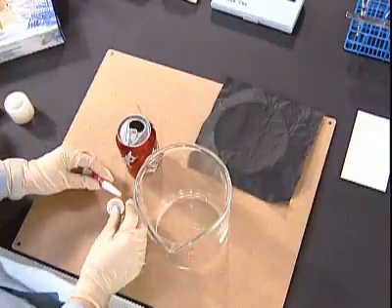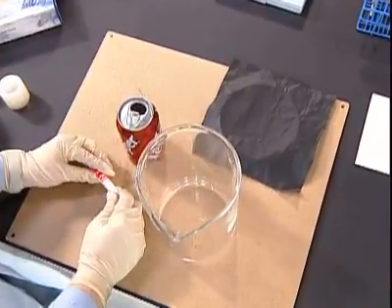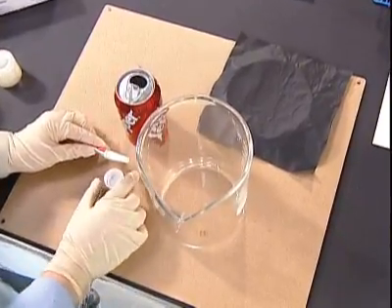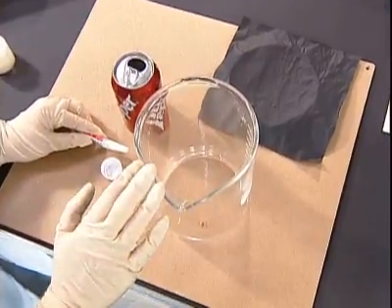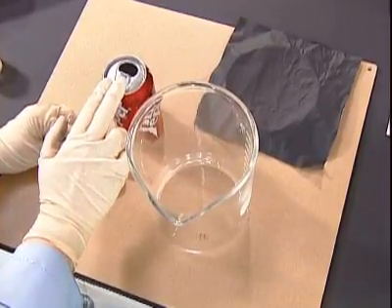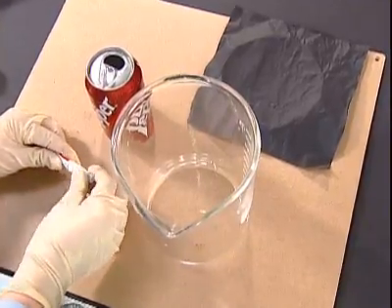The combination method for enhancing or visualizing latent fingerprints involves the use of superglue. What we're going to do is place a few drops of the superglue in this plastic lid. It's going to be placed in our tank, and then the object that's going to be processed that contains our fingerprints is this soda can. So we have to open the superglue.